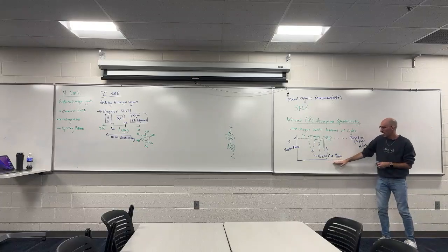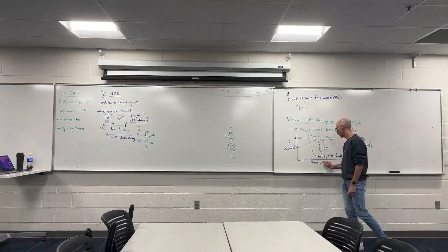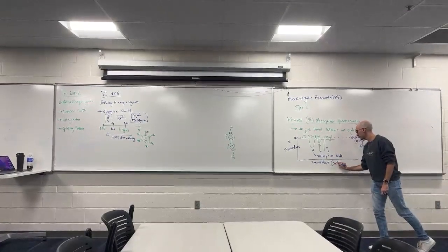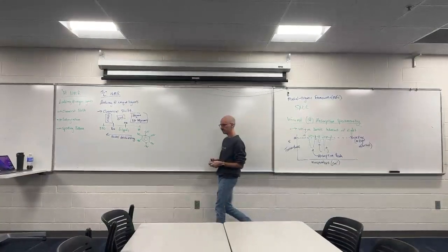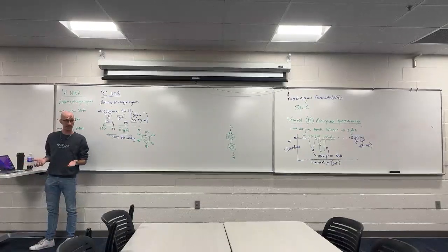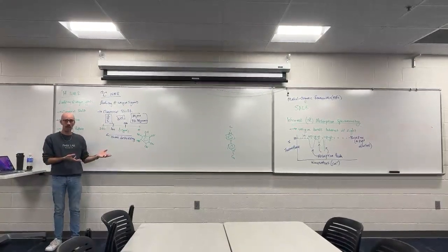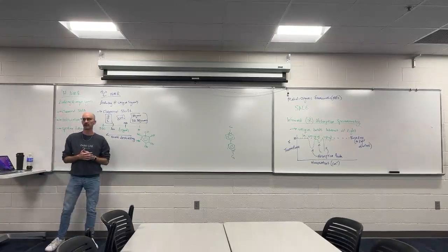Along the x-axis, we're looking at wave numbers, which is probably not a unit any of you have ever heard of before. It has units of inverse centimeters, centimeters to the -1. And we're looking at light, right? Light has two components, wavelength and frequency. With wave numbers, are we reporting the frequency of light or the wavelength of light?